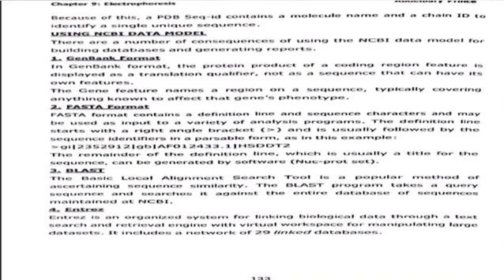3, BLAST. The Basic Local Alignment Search Tool is a popular method of ascertaining sequence similarity. The BLAST program takes a query sequence and searches it against the entire database of sequences maintained at NCBI.